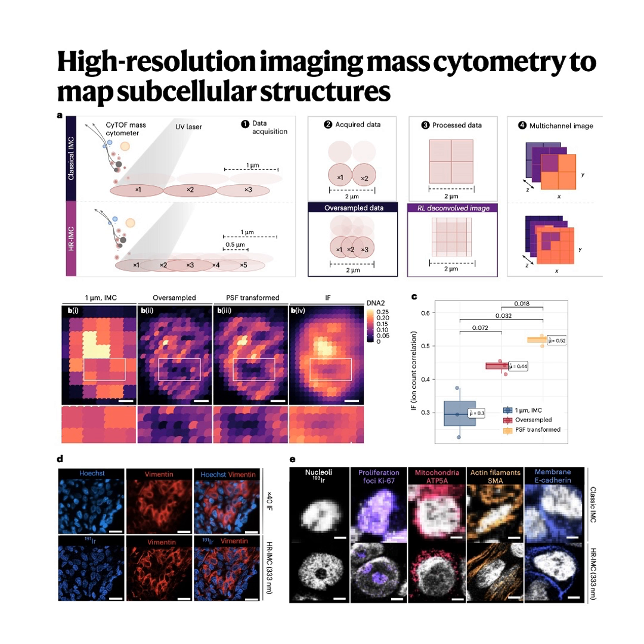Right. But the real insight comes from the subtle, hidden interactions that low-resolution imaging would miss entirely. What was the aha moment here regarding the molecular colocalization? The ability to see where the DNA damage was actually happening. They detected a significant gain in the colocalization of phosphorylated histone H2AX. That's the DNA damage marker. Okay. Specifically in regions that were marked by histone methylation and acetylation variants. And those variants mark areas of open transcription. Exactly, where the genome is active and being read.